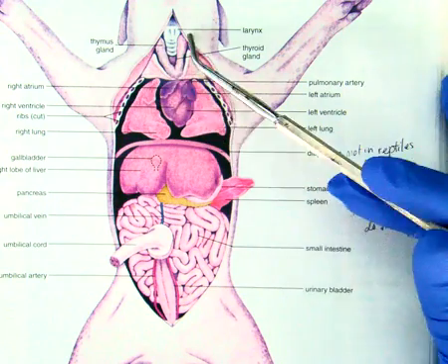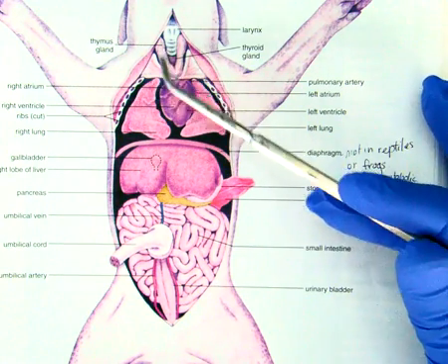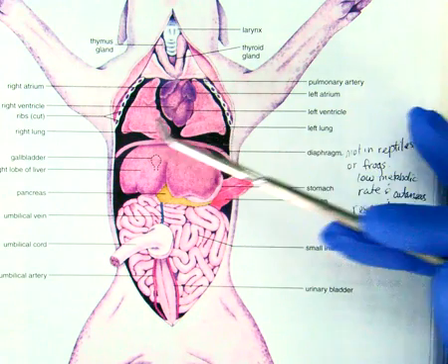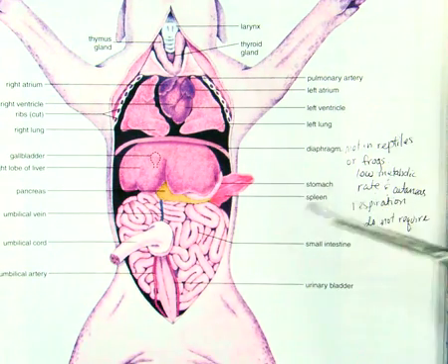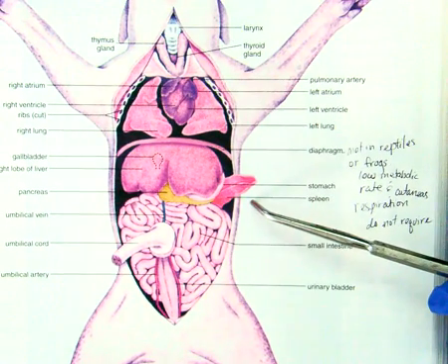You might be able to see the thymus gland, which is a little bit lower than the thyroid. So that's the thyroid here, one round singular. The thymus is bilobed, so two parts to it. Then the heart, lungs, liver, and gallbladder, which should be slightly discolored from the bile in it. Stomach, and the spleen should be evident for us.